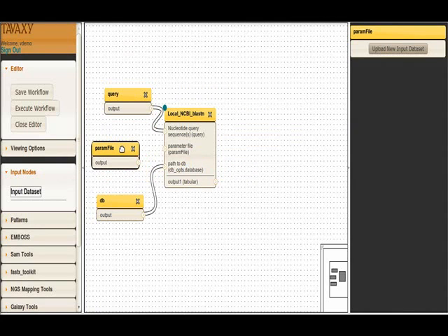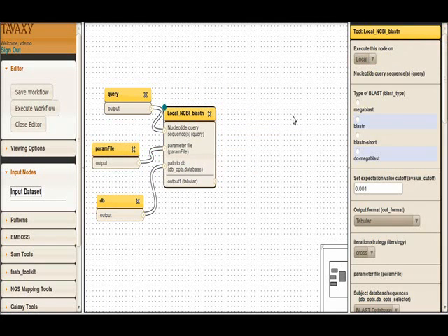This param file contains values for the parameters of the Taverna BLAST that we see here on the right, so that they can be changed during the runtime. Instead of setting them during the composition time, they can be edited in the param file by editing the file that's entered here in a specific syntax that's described in the manual.